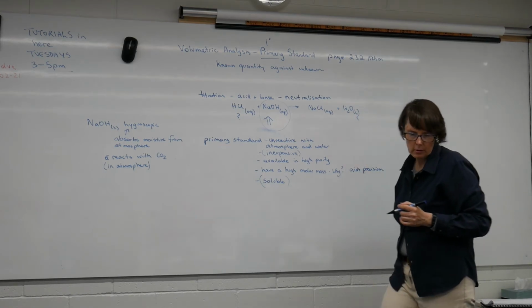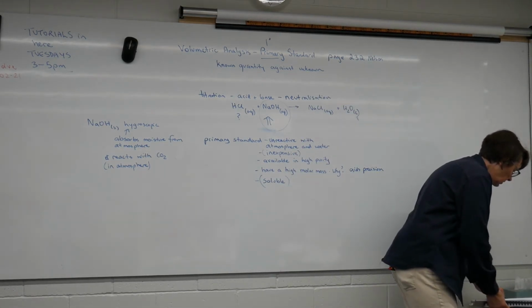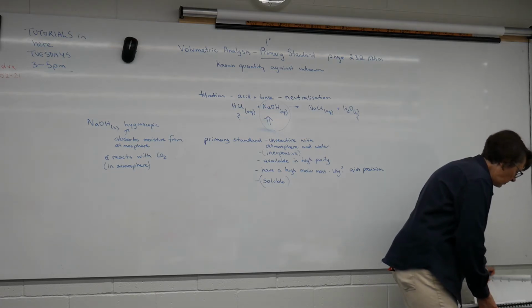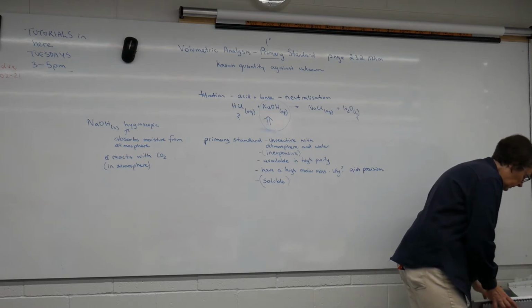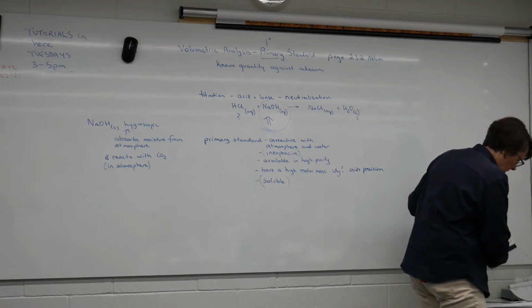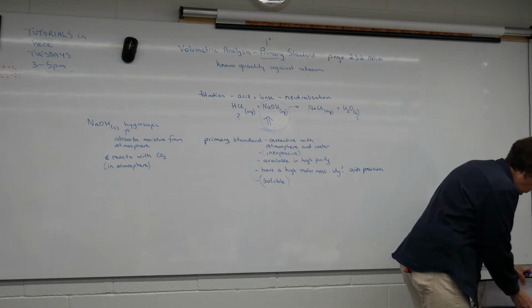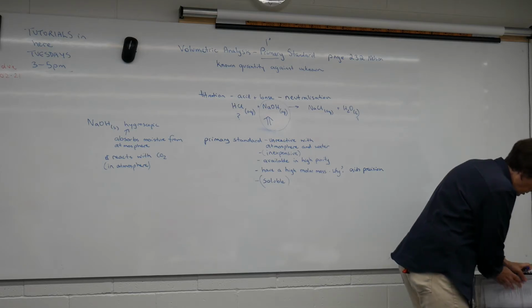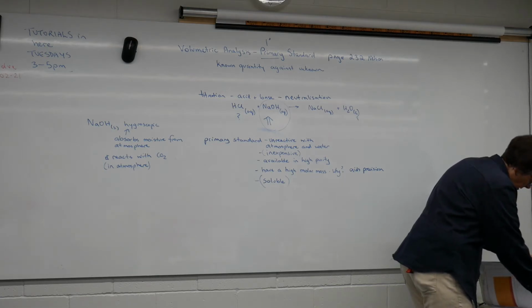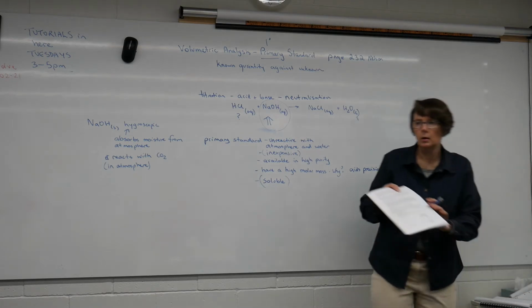And so, if you look at the Prac that we're going to do, you can see that we're going to be starting out with making up a solution of our primary standard. So if you want to pull out your Prac, okay, this one here.